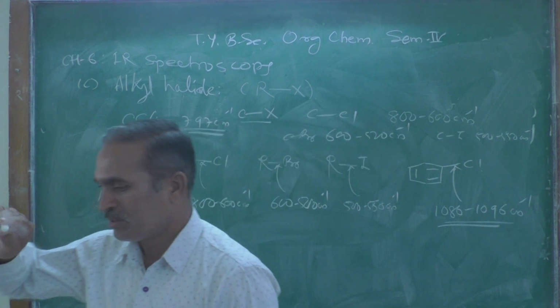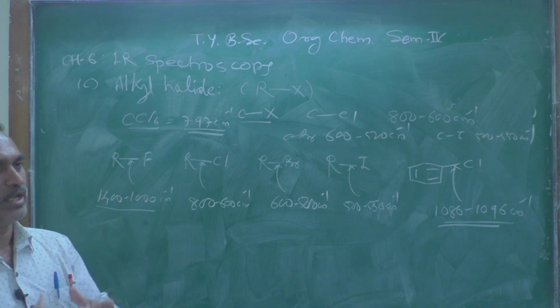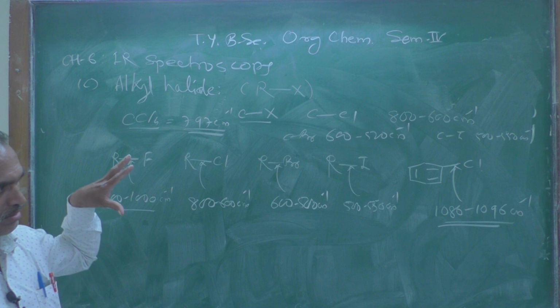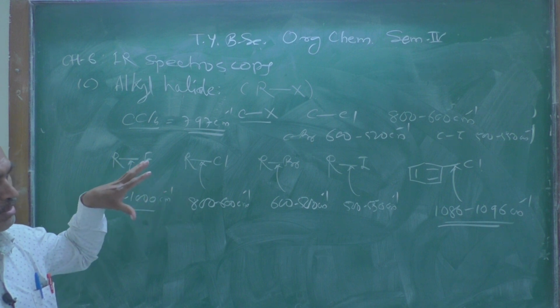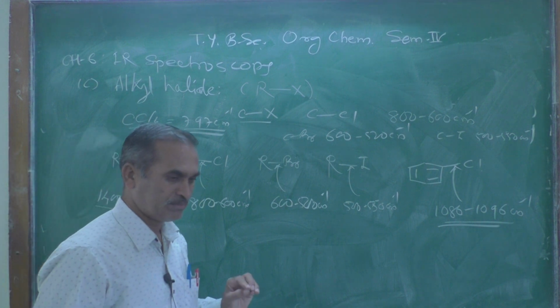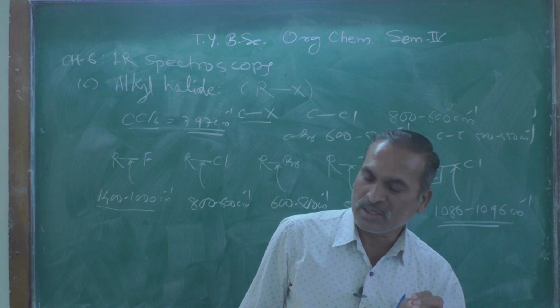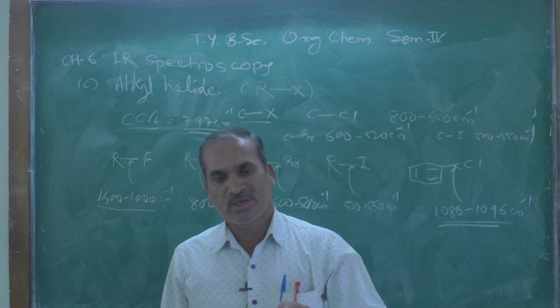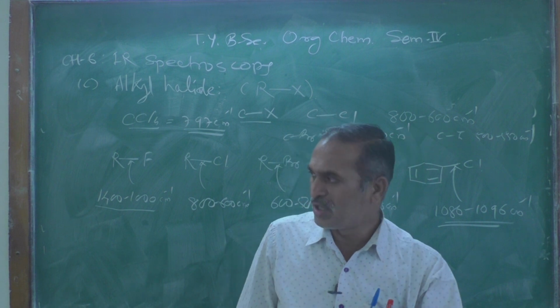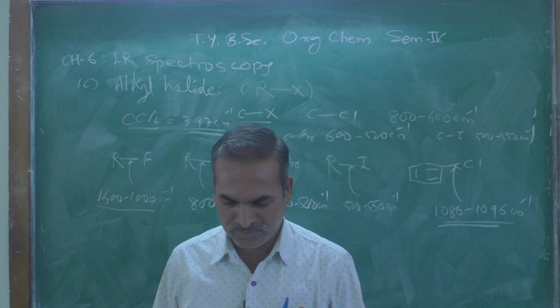So by knowing the exact peak of the IR band, we can identify what kind of functional group is present in the organic compound.